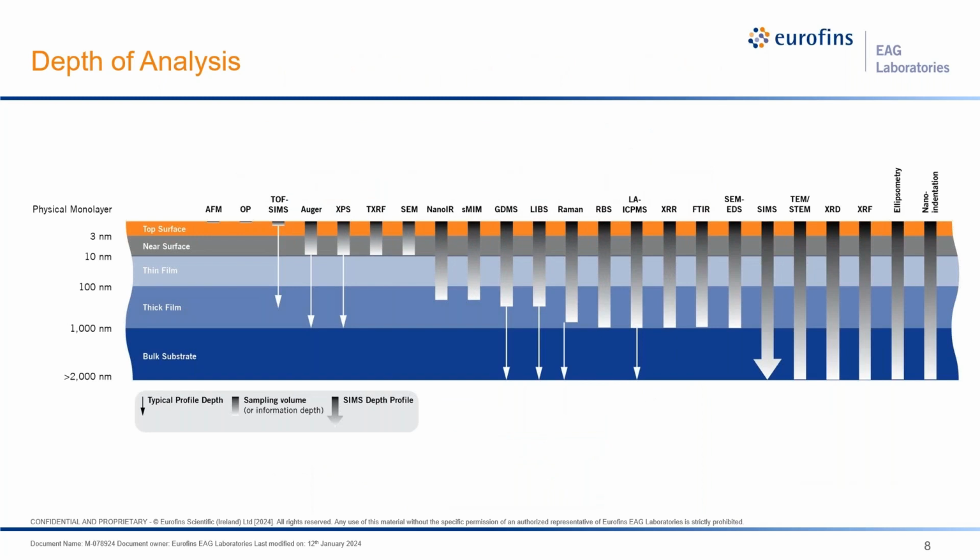What we're also looking at is depth of analysis. For all those techniques, there's a sweet spot in depth, whether it's the first few atomic layers, like in time-of-flight SIMS, Auger, and XPS, or more into thicker films, into the nanometer or even micron thick films, or then into the bulk. And as we go from left to right, we can see the techniques laid out in depth of analysis. So we can take advantage of that. So depending upon what you're trying to look at, whether it's a surface contamination to identify, a film composition to identify, a bulk to identify, we can choose the right technique to give you that sweet spot, to give you the best data possible.